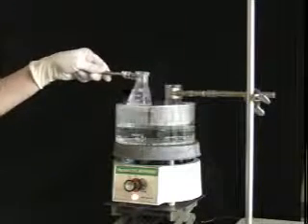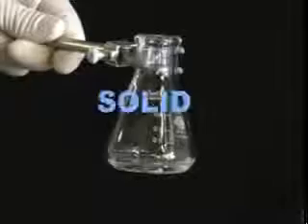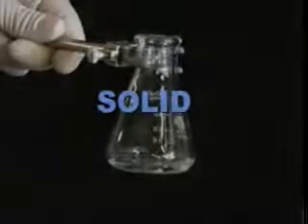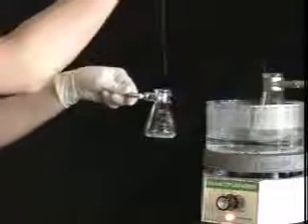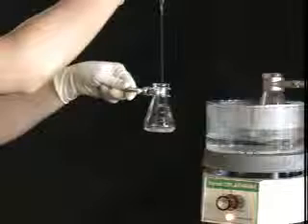Remember to add a few boiling stones to the solution and boil until solid begins to form. At this point, add a small amount of hot solvent to redissolve the solid. When your sample is once again dissolved in the minimum amount of solvent, set it aside to cool. Cover the flask to prevent contamination with airborne particles and allow it to cool to room temperature undisturbed.